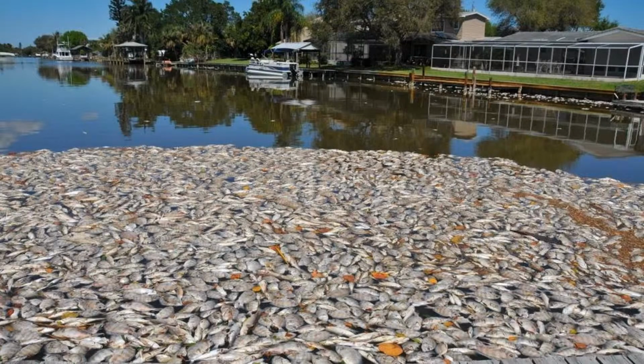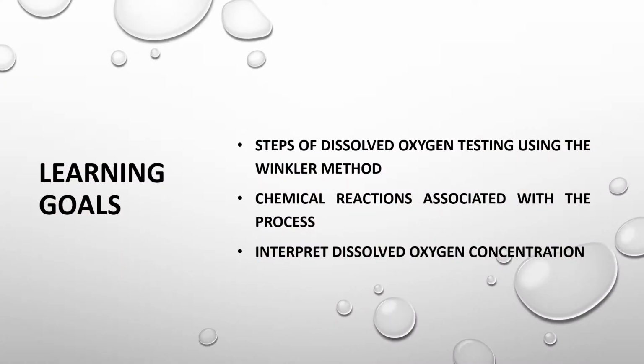Testing for dissolved oxygen content reflects one important factor of the health of our waters. Low oxygen levels could negatively impact tourism, fishing, and public health. Today, we will be using one of the more common tests for dissolved oxygen, the Winkler method.